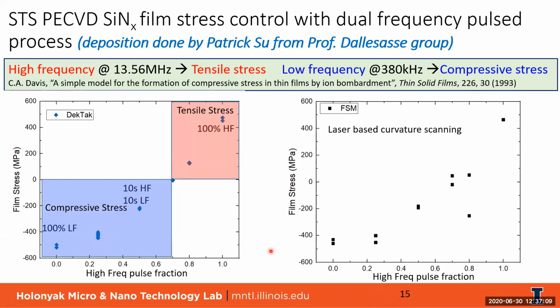For the most part, they agree fairly well, except maybe 1 or 2 data points here, probably because we didn't have a motorized stage here. It's much harder to repeat the same position for the scan.